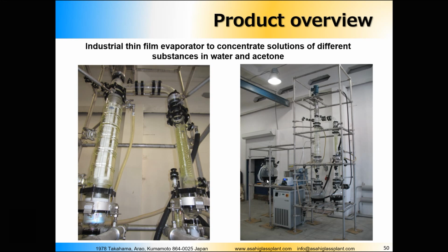You can see the big 50-liter dosing flask here, and the injection point into the thin film evaporator is on the top over here. So there were two options. Either we should put the flask up to the top, but then we will have a problem with feeding the flask.